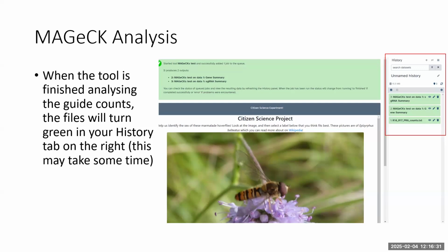Yeah, you need to basically develop a pipeline that will do that. So that's kind of Nick's domain. He'll develop a pipeline that will generate all the genome information in the right format in one file, able to put into his pipeline. The pipeline then designs guides based on sequence and proximity to the 5' end. It'll then give each a score based on the parameters that Broad have developed to see if it's likely to work as a guide. And then the key thing is scoring the off-target effect.